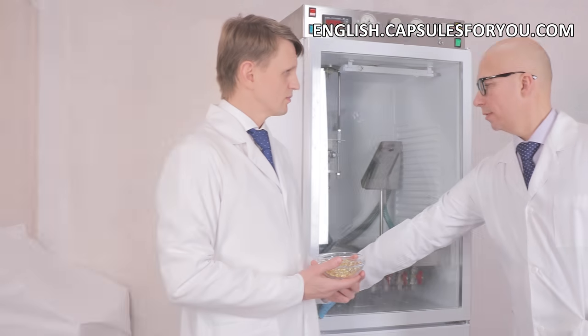The specialists of our company will give you a detailed description of our equipment features, make recommendations on preparation of your premises, help with finding raw materials, adjust equipment and train you to work on it.